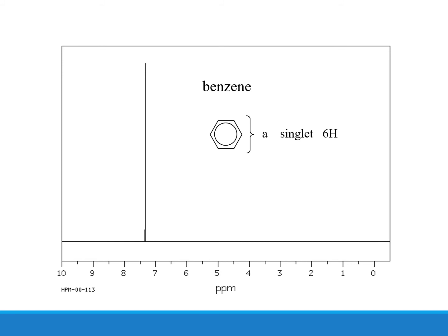singlet. For benzene, all the hydrogen atoms are in the same environment. Again, you will have a singlet. But notice here that even if they are a singlet, their chemical shift varies depending on how different electron density exists in that structure, right? So compared to the previous examples, we see the benzene is highly deshielded to the left because of the aromatic pi bonds available in the structure.